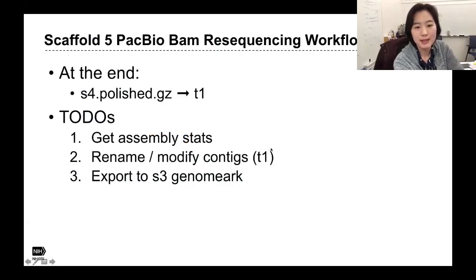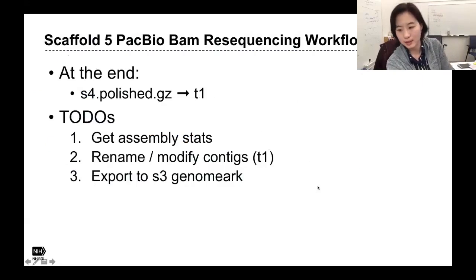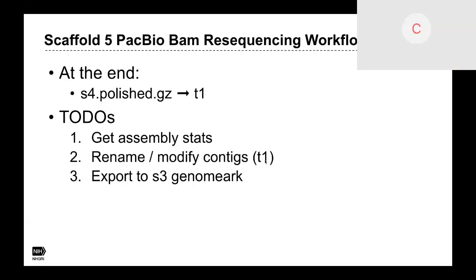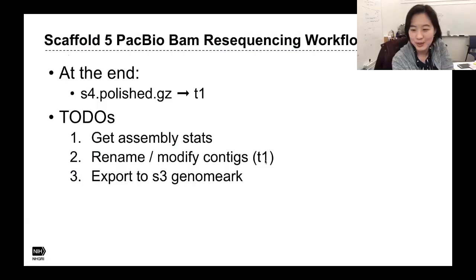And again, get the assembly stats and export this to GenomeArk. Here, the names will have a pipe arrow at the end of the name. And I forgot which step it was, maybe Chai can chime in, that we replace all the pipes back to underscores. I think that was before running Long Ranger. Let me check. Yeah, but FreeBayes throws out some warnings if it sees the pipe. I don't know if that was because of the pipes, but we're suspecting that this is the case.